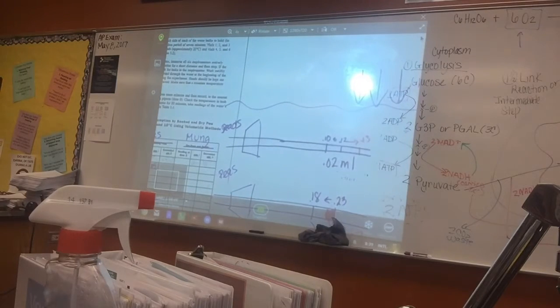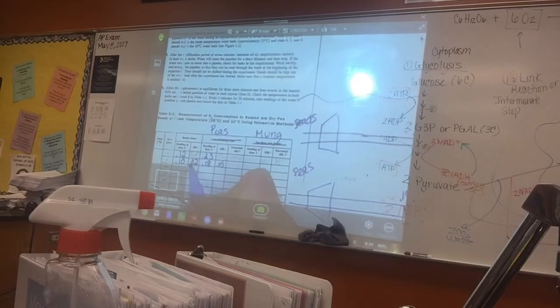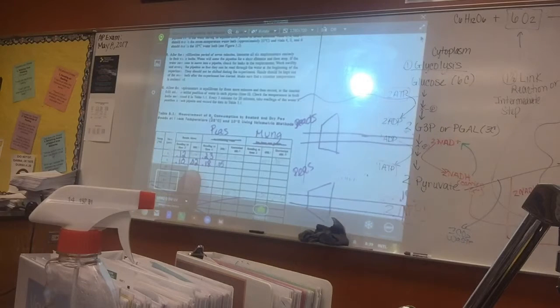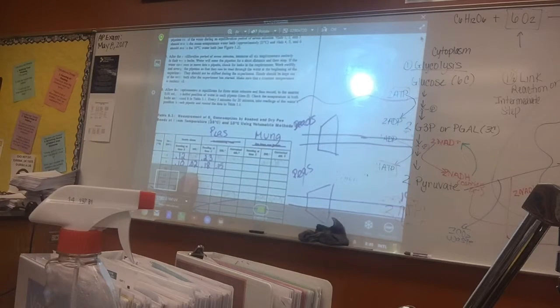So then how that relates: your difference here, take initial minus the time, so 0.12 minus 0.13. If this is my data, I would have a negative 0.01. Then it stayed at 0.13, so it would be a zero change at the next step down. So this would be a negative number here. Now let's look at the second data.